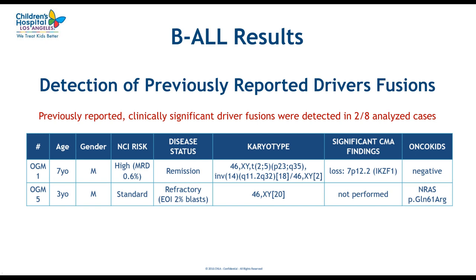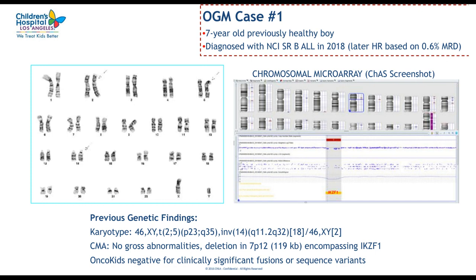When we look at our 8 BLL cases, in 2 out of 8 cases, optical genome mapping detected previously reported and known driver fusions, which remained unknown after our comprehensive analysis. So I will describe these cases in detail. This was the first case.